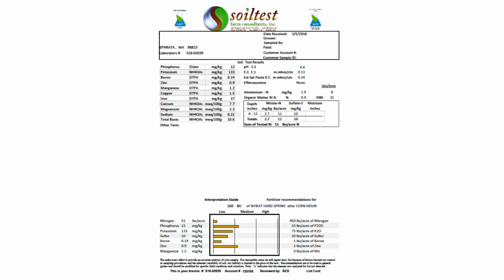Today, I would like to show you how, step by step, I read and interpret a soil analysis report. Our laboratory produces reports in various formats, and today I will give you 3 examples of such formats. The first thing that I'll note is where the sample comes from, in this case, Ephrata, Washington.